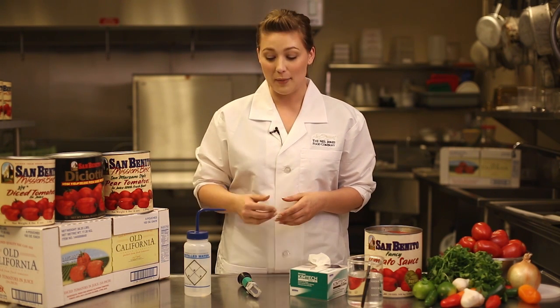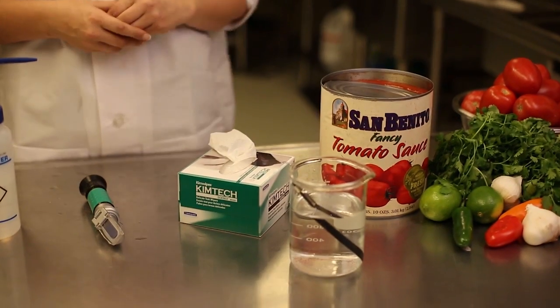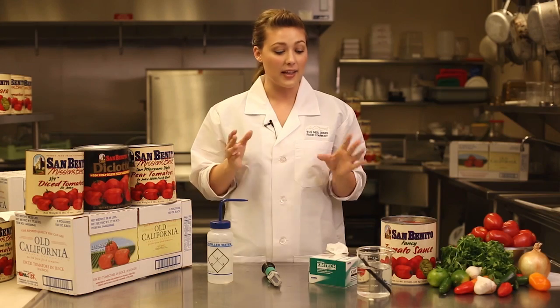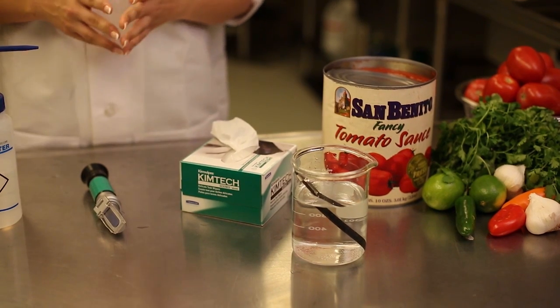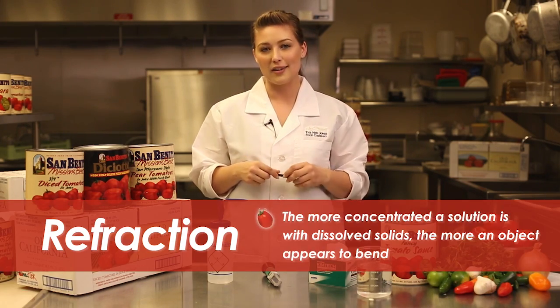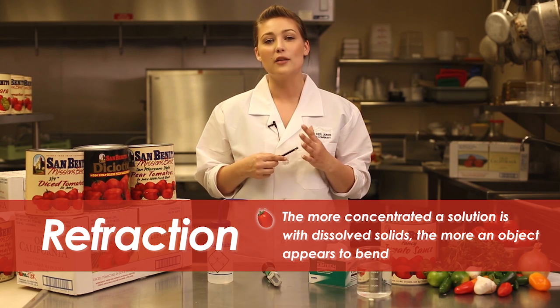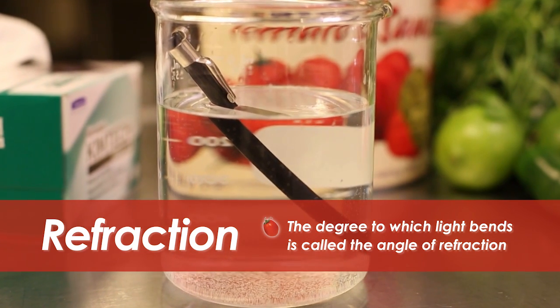Today we're going to be talking about the handheld analog unit. Here's how it works. When you take an object like a pencil and place it into a glass container with water, the object appears to be bent. Since light bends when it enters a solution, it creates the effect that the object is also bending. This is called the refraction of light. The more concentrated a solution is with dissolved solids, the more an object appears to bend. The degree in which light bends is called the angle of refraction.